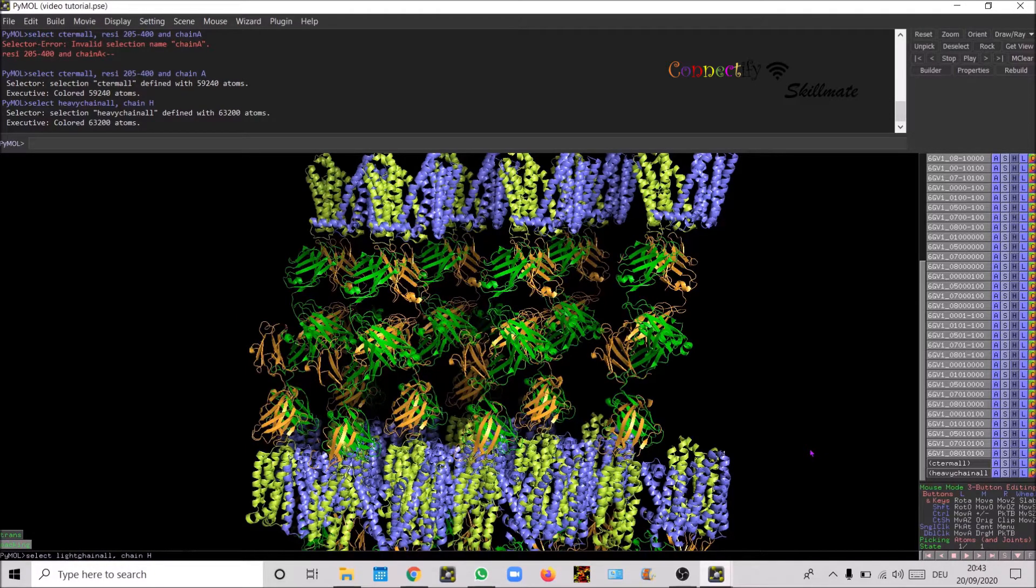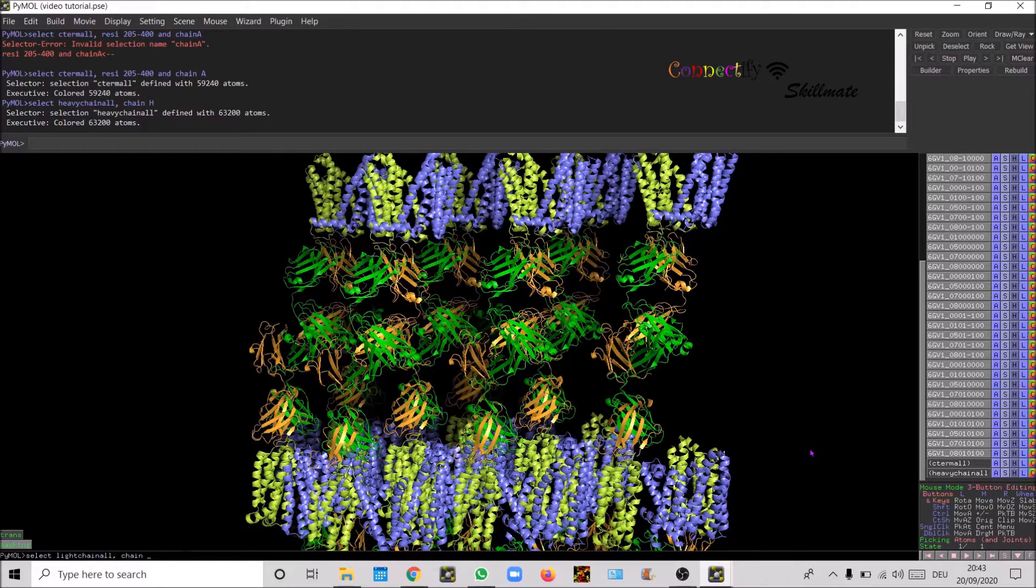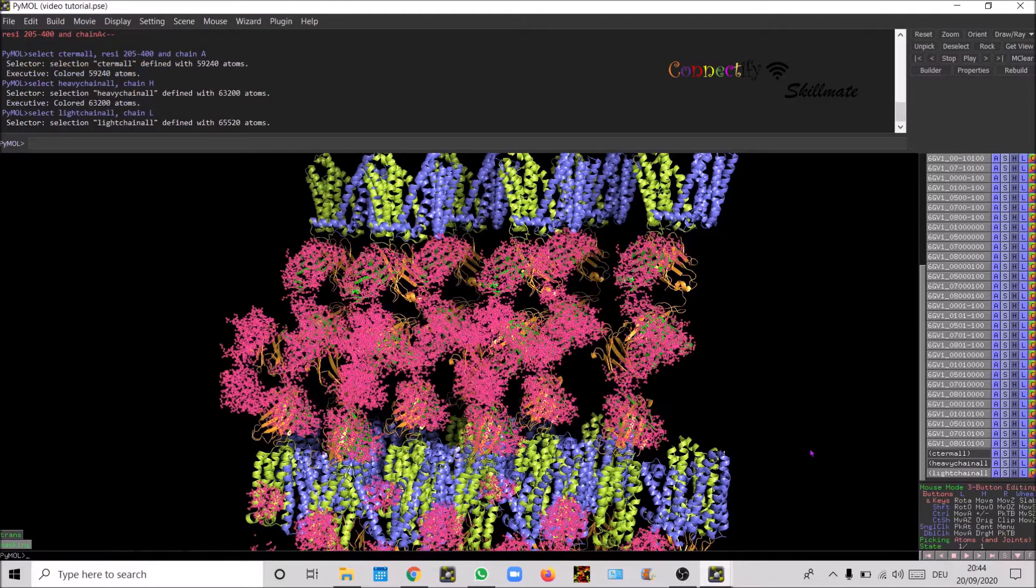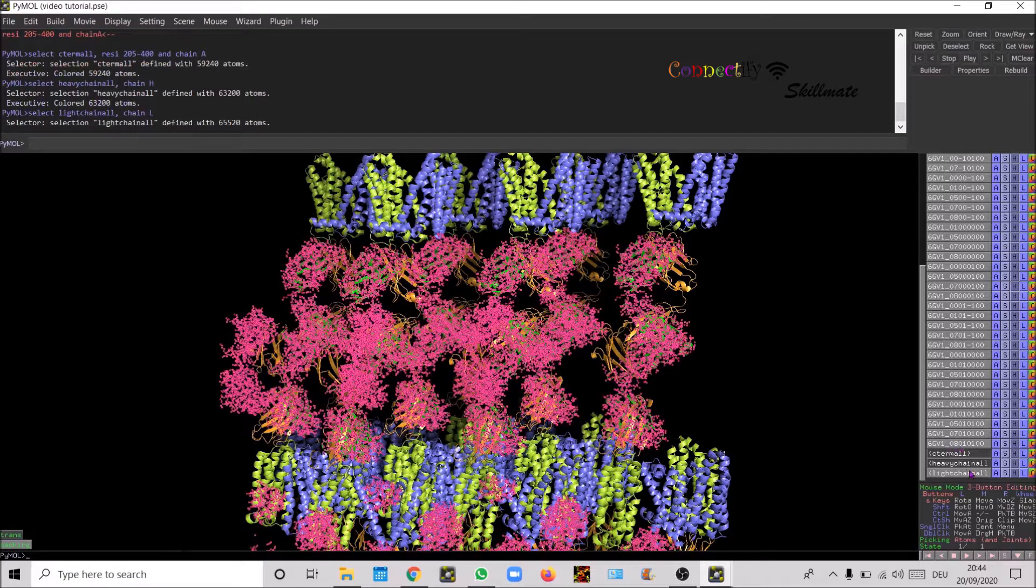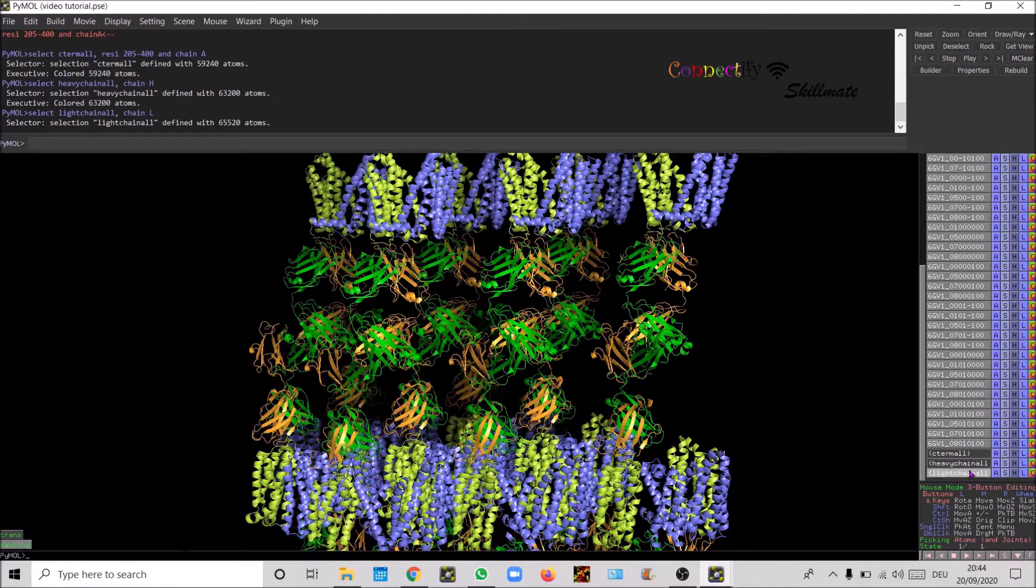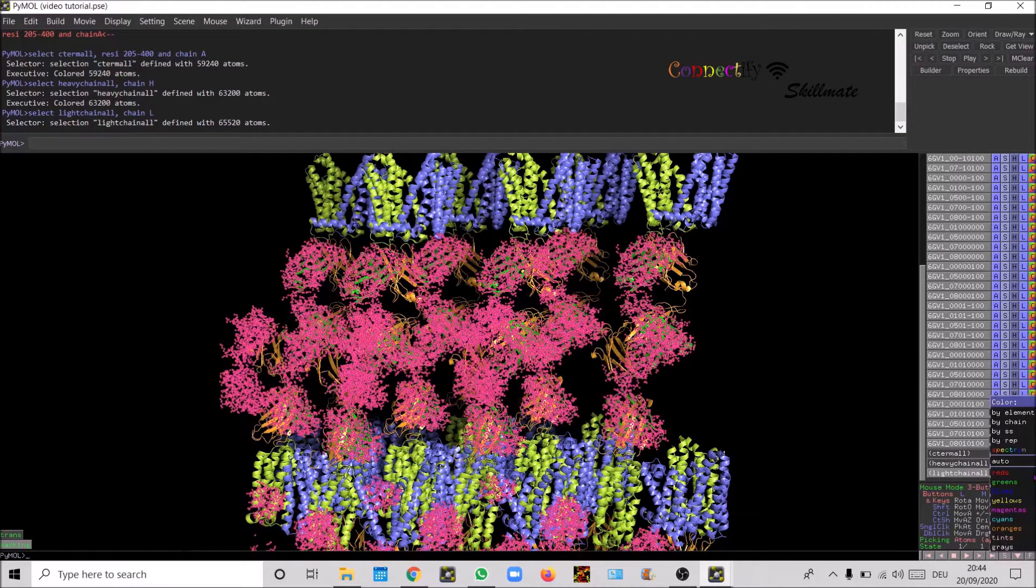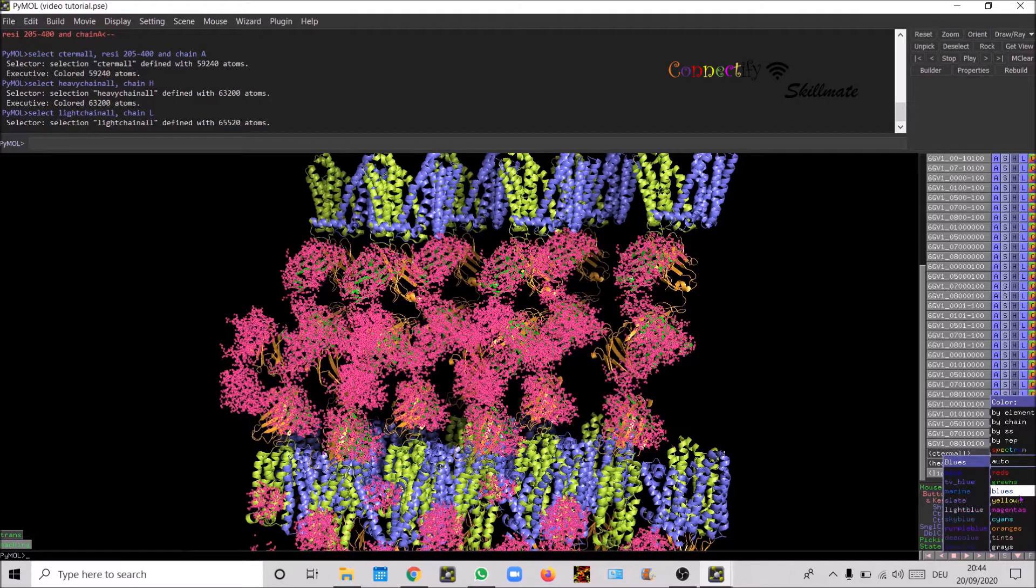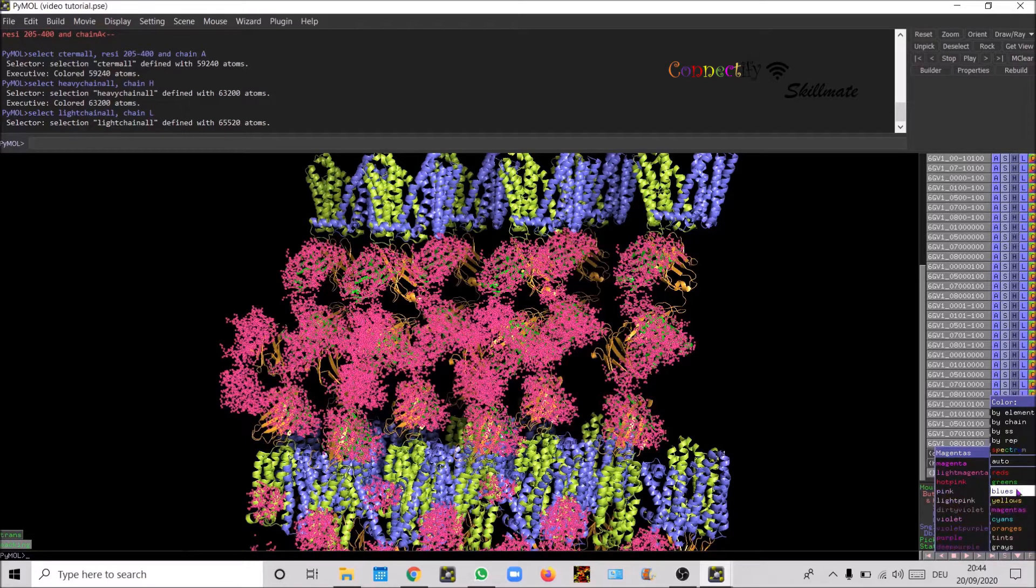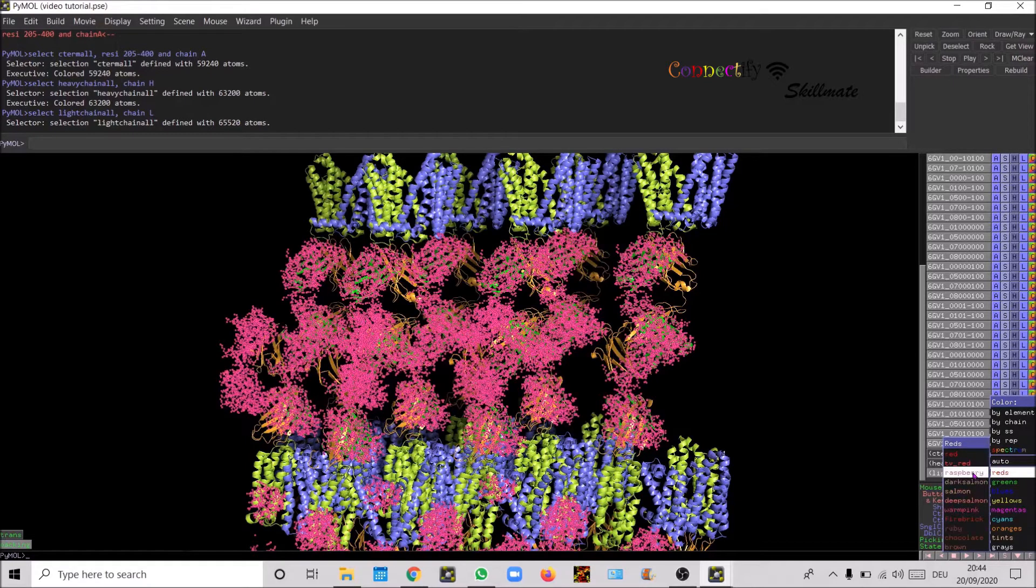Light chain all and then the chain here is chain L. Chain L for the light chain. Now the C chain is selected, light chain is selected. Let us know.